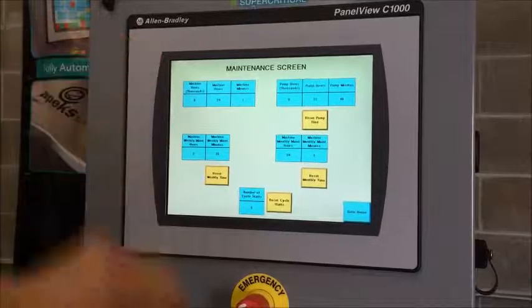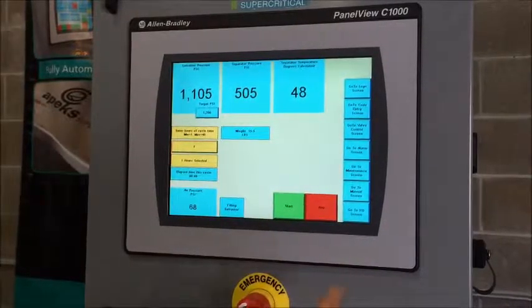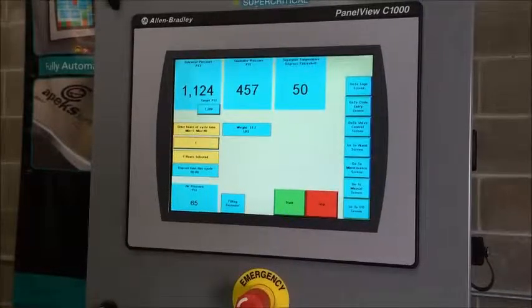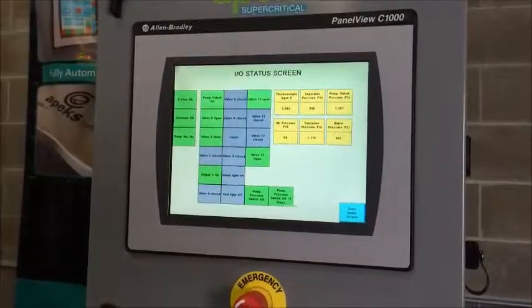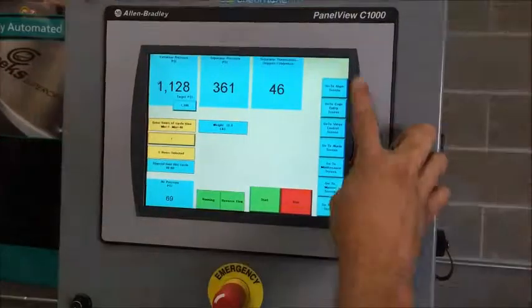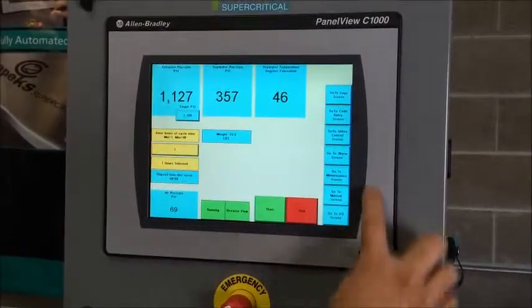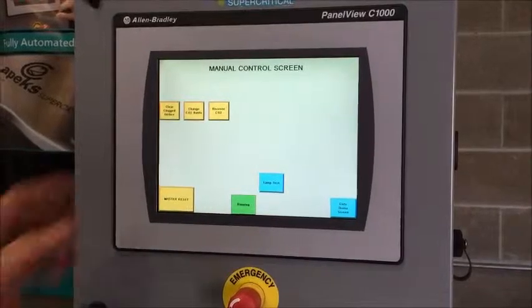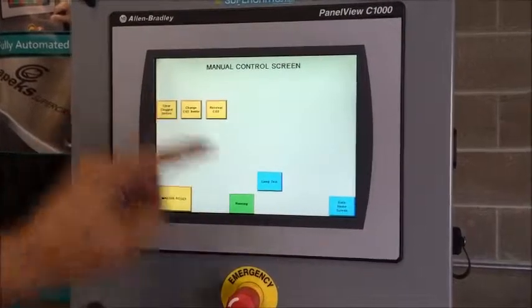We have the maintenance screen, which keeps track of hours on everything — four resettable functions: pump hours, cleaning hours, how many times the system's been started, and master hours and minutes. We have the manual screen, which I'll come back to in just a minute. We have the I/O screen — a troubleshooting or debug screen to let you know what's going on at that moment.